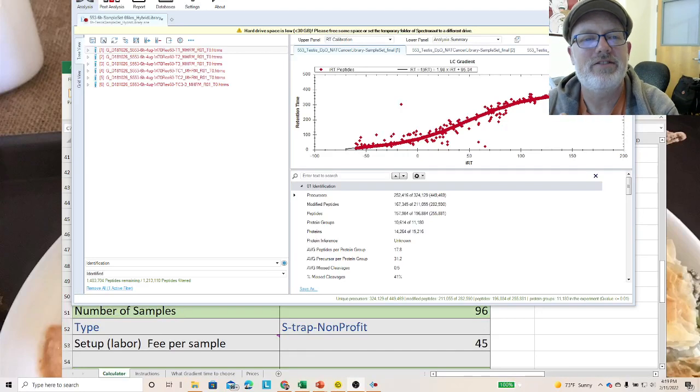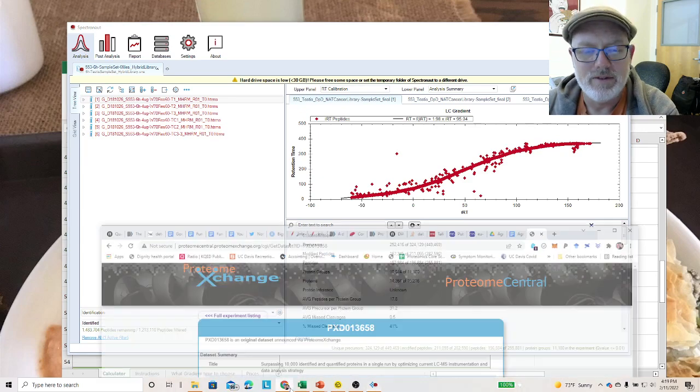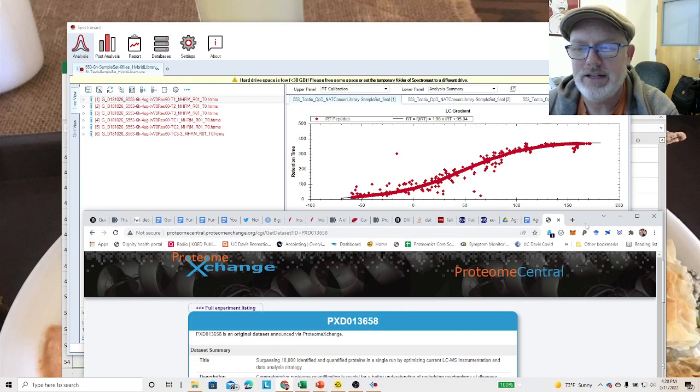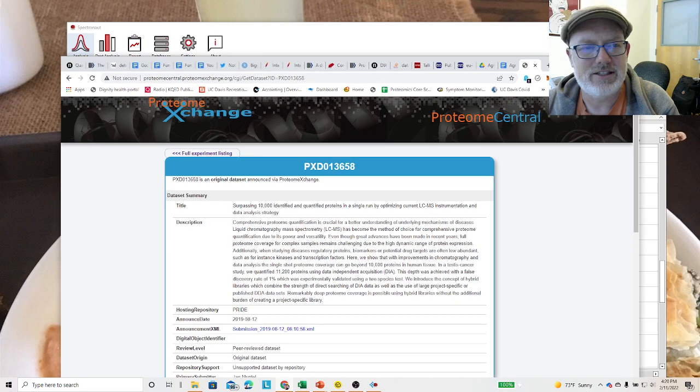I thought I'd give you a 10-minute video on looking at what's inside your export folder that we export from Spectronaut. Today I have downloaded an awesome data set. This is data set PXD013658 from ProteomeXchange, and this is surpassing 10,000 identified and quantified proteins in a single run in optimizing LC-MS conditions.